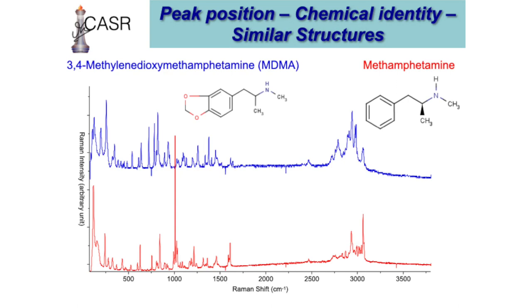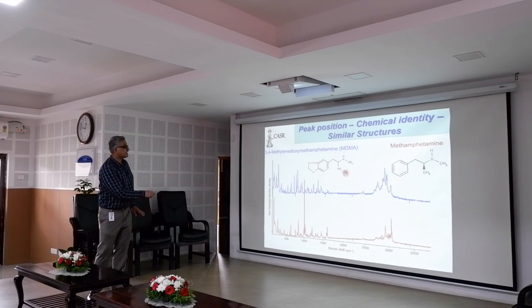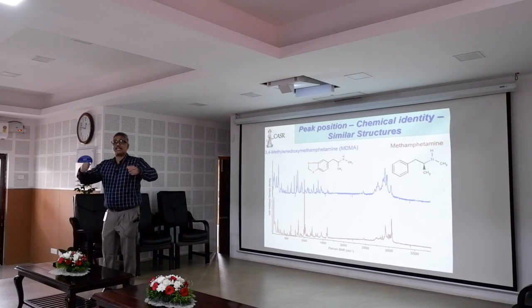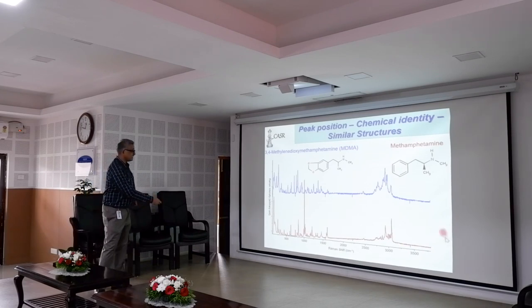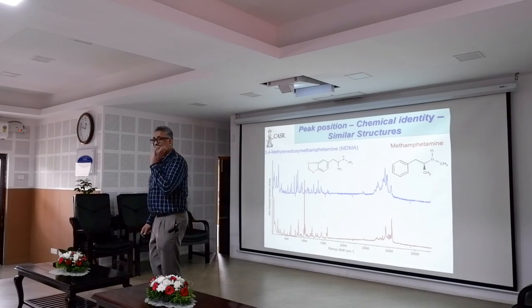If I want to find out whether the starting compound is there or the MDMA is there, you know the difference: this is singly substituted benzene. I'm not going to look at anything else. And this is triply substituted benzene. And there is a benzene vibration. You know, benzene can breathe. This breathing vibration, if it is connected at three points, will be lost. And that is 1000 centimeter inverse. You see this 1000 centimeter inverse? It is completely disappeared. I don't have to look anywhere else. I can tell you whether this is the starting compound or not, just by looking at it.